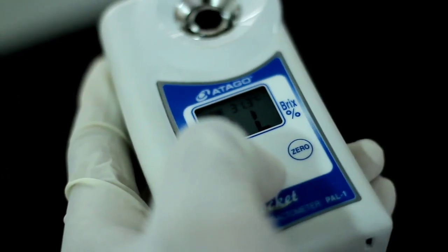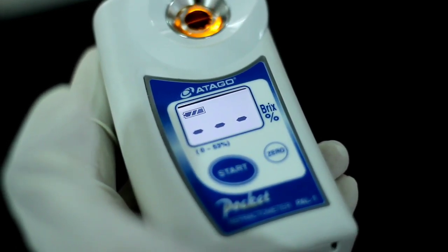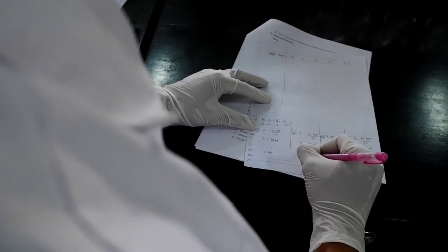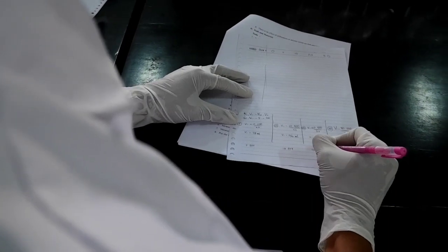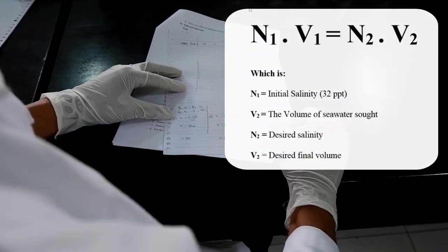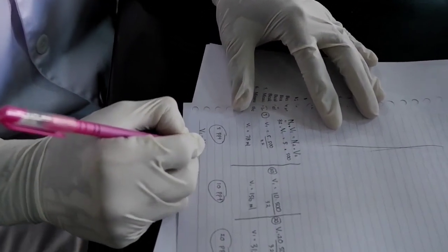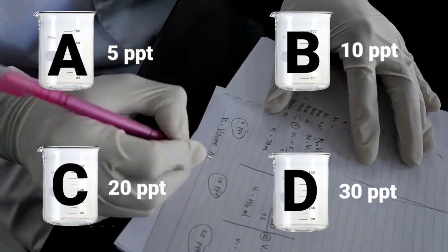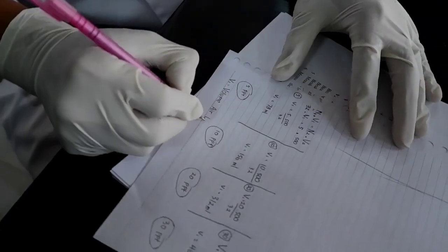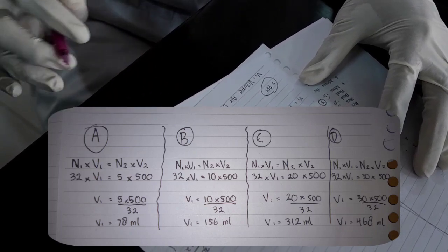The next step is to check the salinity of the sea water. The second step is to make four different salinities in each beaker glass. We can determine the desired salinity using the following formula. I want to make four different salinities: glass A at 5 ppt, glass B at 10 ppt, glass C at 20 ppt, and glass D at 30 ppt. This is my calculation to determine how much sea water is needed to mix with fresh water.